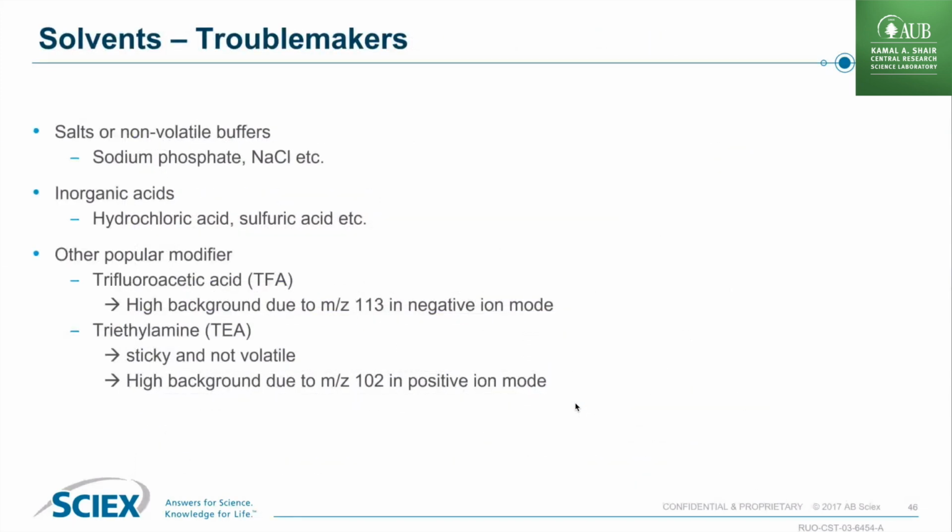So what are some troublemakers? Like I said, if you stay with the components that we had on that first slide about solvent, you will be 100% okay. I guarantee you that. If you want to use something else, especially at the beginning, you're welcome to write me a short email and say, hey, I have this buffer system from this paper. Can I use it? I will answer you.